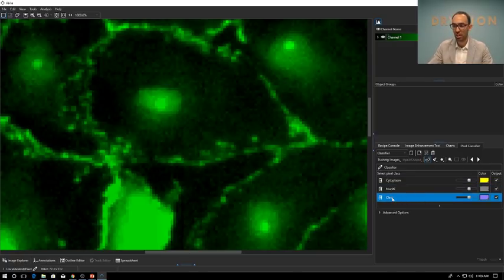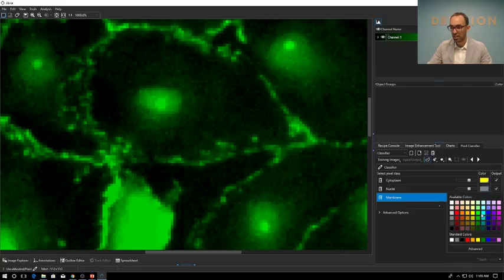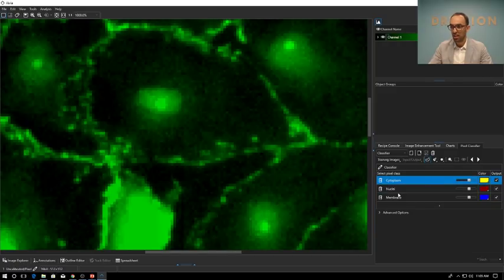And I'll have a third channel, which will be membrane. Okay, I can adjust the colors, so I'll change these colors slightly, just to be a little bit easier to visualize. Okay, and I start my teaching.